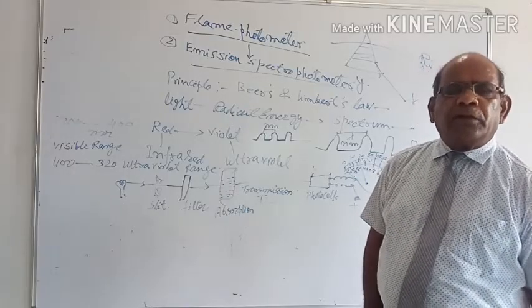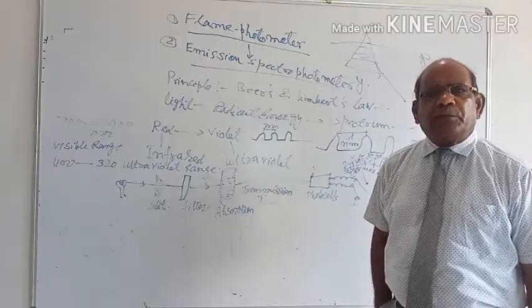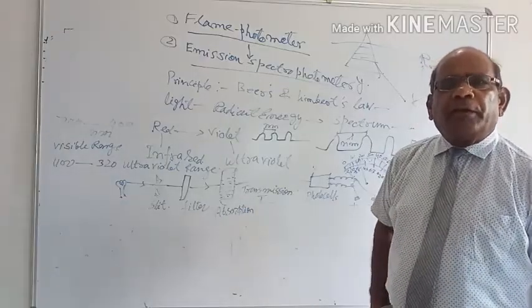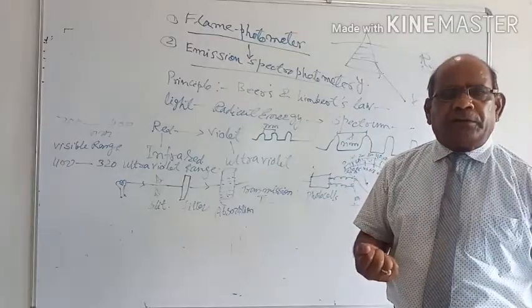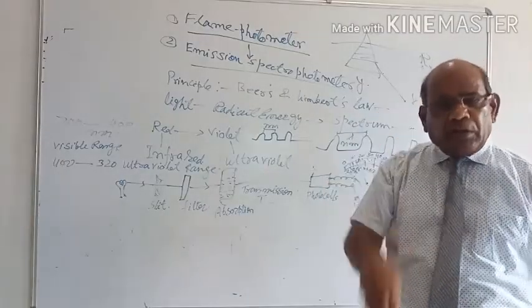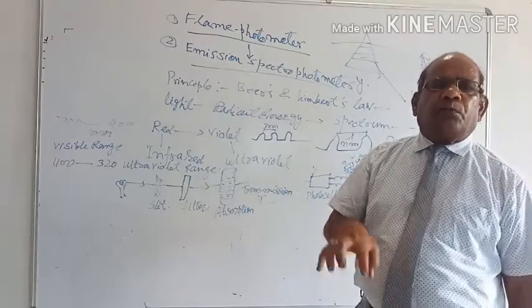Emission spectrophotometry, do you understand the meaning of emission? Where something emits out is emission photometry. Where something is absorbed is absorption photometry.